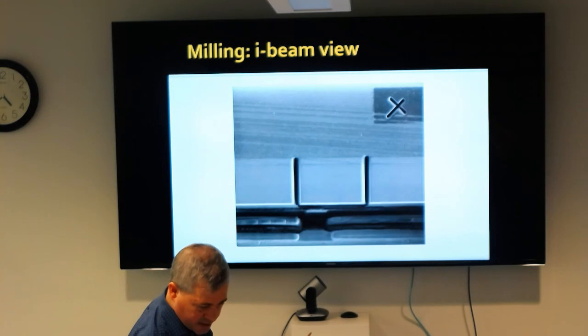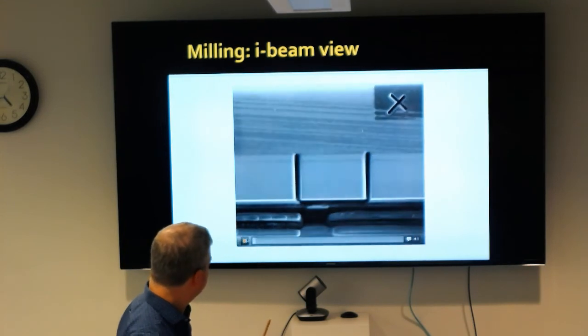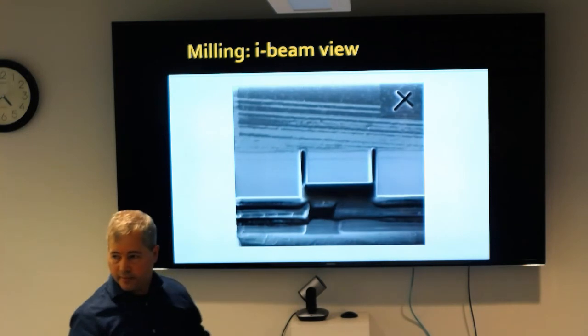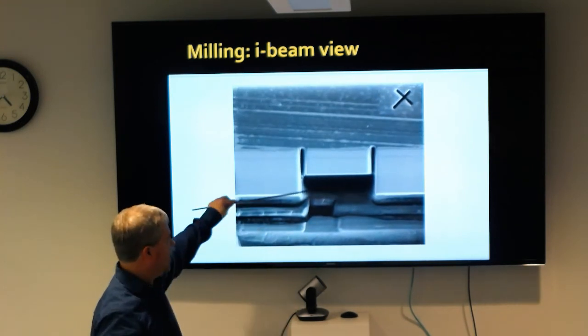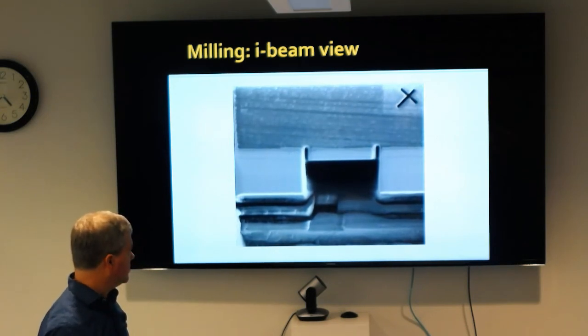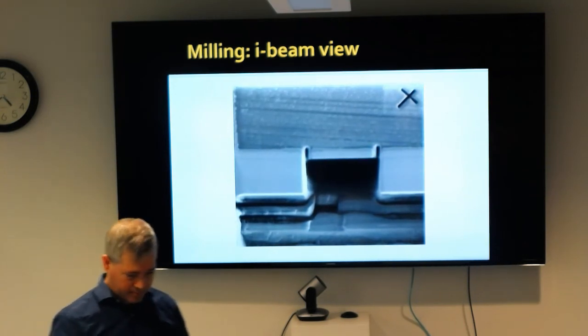And this is the ion, the view of the same thing from the ion beam. Where it's cutting through. Again, 20 nanometers at a time. That's great. Okay, thanks.